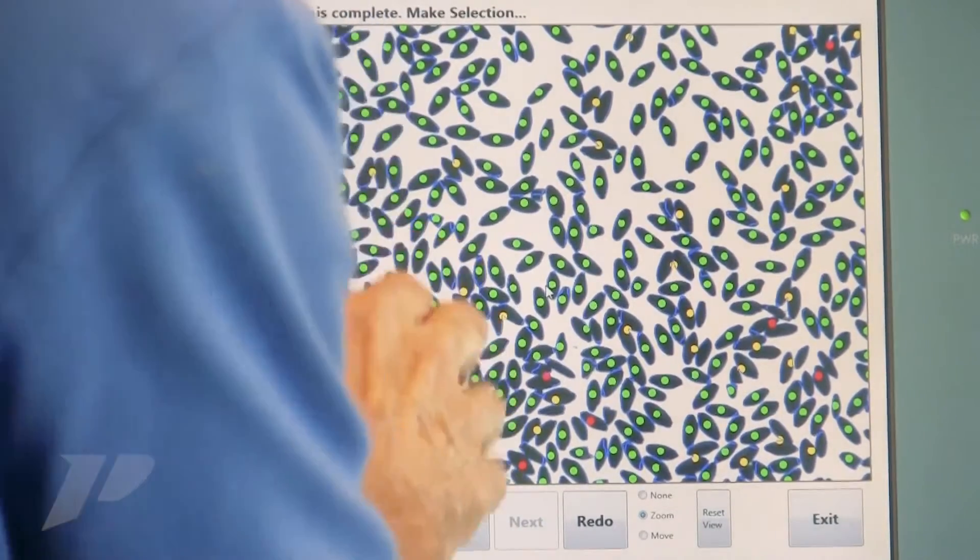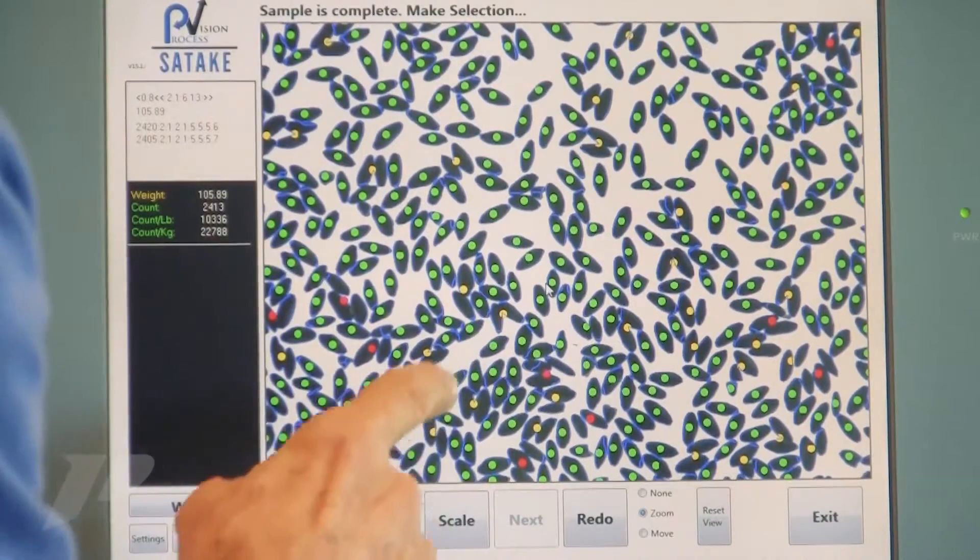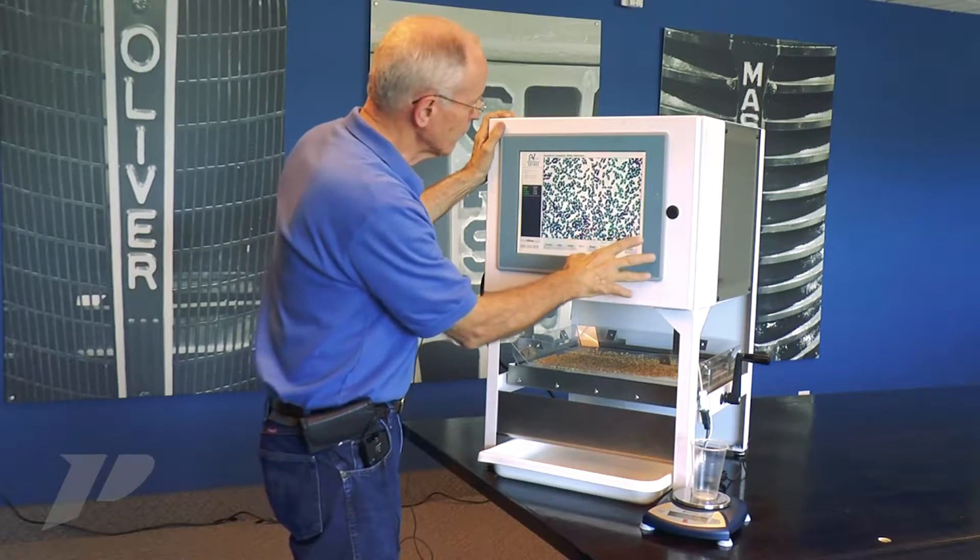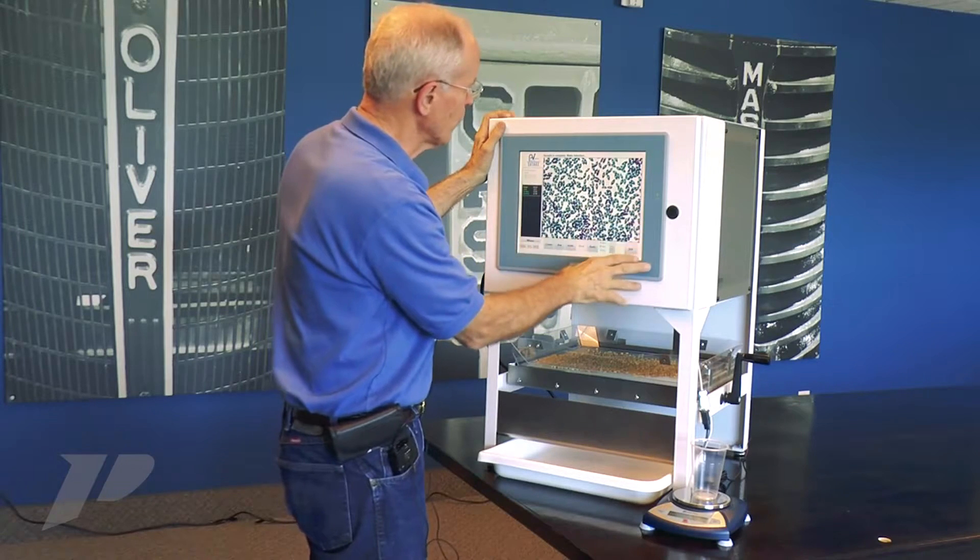You notice we put a green dot on the singles. We put a yellow dot on some that are doubles. We put a red dot on ones that we count for three. I'm looking for the counts to be correct.